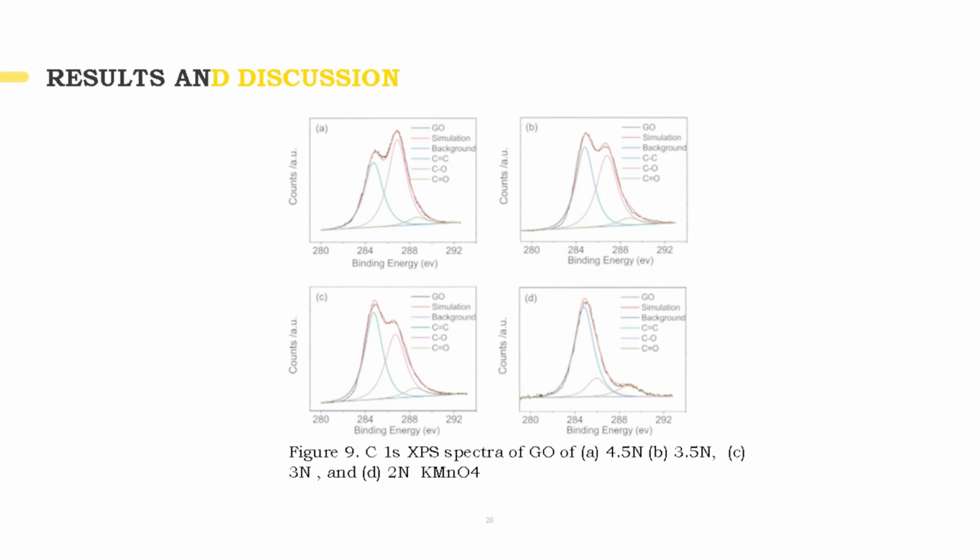As shown in the previous figure, based on the above facts, it is inferred that the change of the ultraviolet visible absorption intensity observed for graphene oxide is caused by the conjugative effect of chromophore aggregation, which influences the plasmon peak.